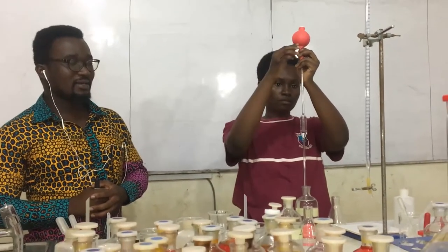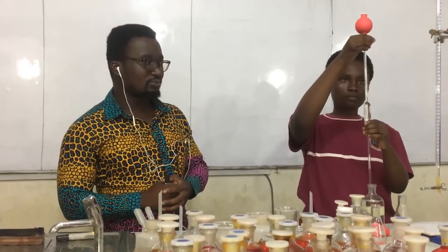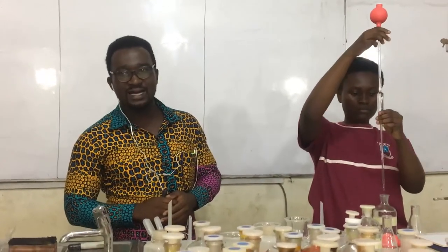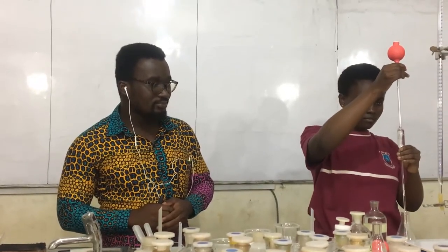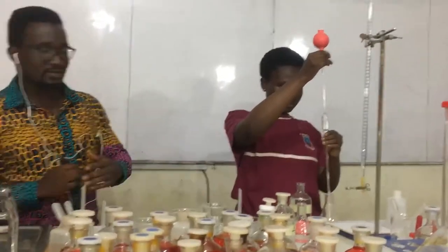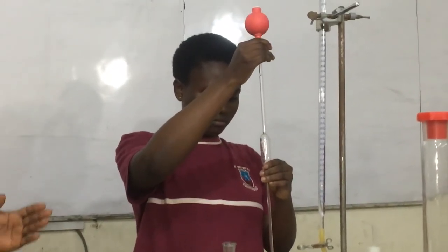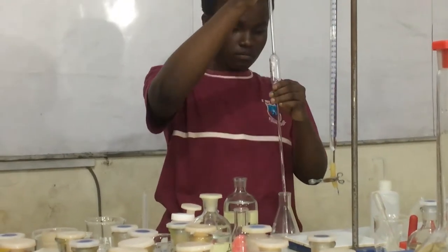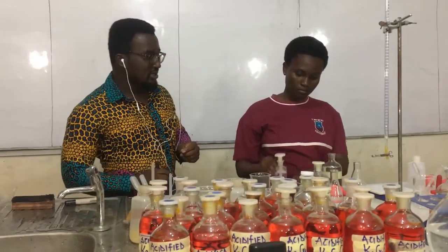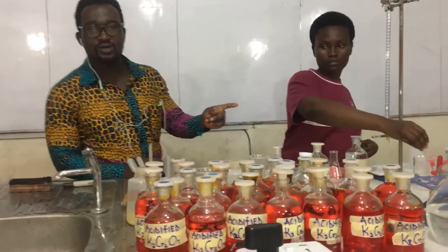This time she's pipetting the 25 centimeter cube portion of solution B to be used. Remember that whenever you are filling the pipette, we always fill above the calibrated mark. Then you regulate to the 25 centimeter cube calibrated mark. And that is what she did. Quickly, she has also transferred the whole volume in the pipette into the conical flask, of which I told you from our theory that when the portion from the pipette is being transferred into the conical flask, it is called the aliquot.